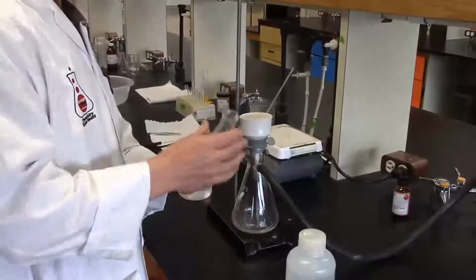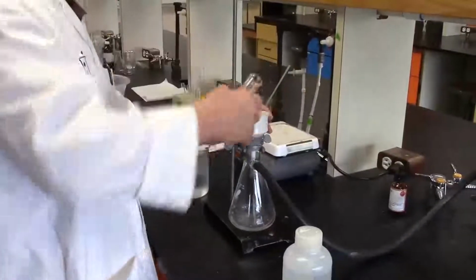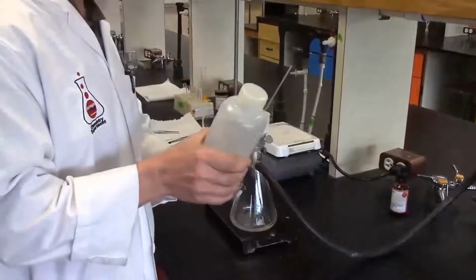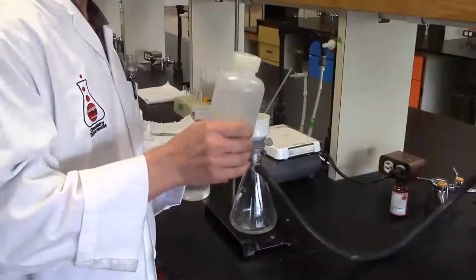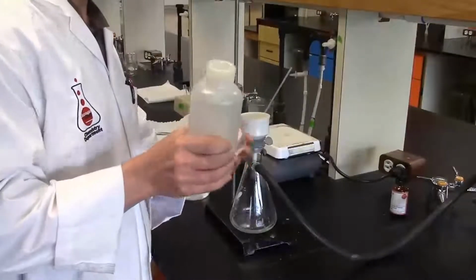Now, while aspirin is not very soluble in water, and especially cold water, you don't want to use an infinite amount of water during these washes, because of course you will lose some of your aspirin, as a little bit will dissolve.